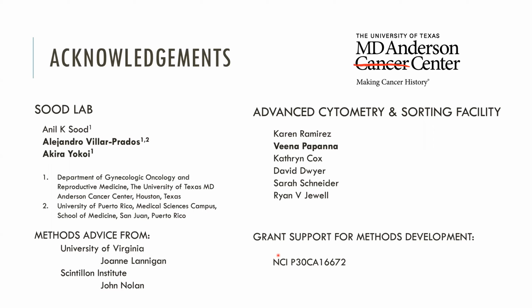Serum-free entirely, okay. We do have someone who's interested in how much for a system, and I can fend that one. That's somewhere between 150 to 500,000, depending on what you get. Unless you want to make a comment. For this, I think you're closer to the $500,000 end of that. Yeah, of course. Oh yes, definitely. Always a good reason why you should partner up with a core if you're at least starting off your experiments.